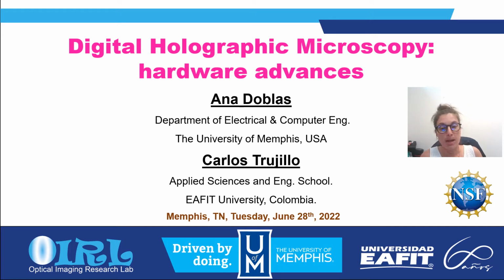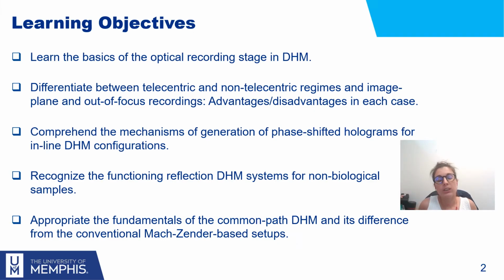In this seminar of the workshop funded by NSF, my colleague Carlos Trujillo is going to help me present the new advances in the hardware for the optical holographic microscopes that you're going to find nowadays. The learning objective of this seminar is to talk about the basic foundations of the optical recording stage in digital holographic microscopy.